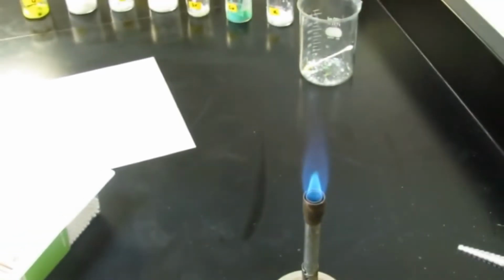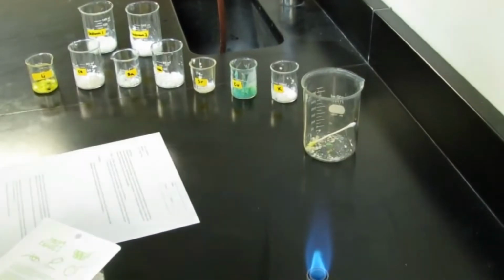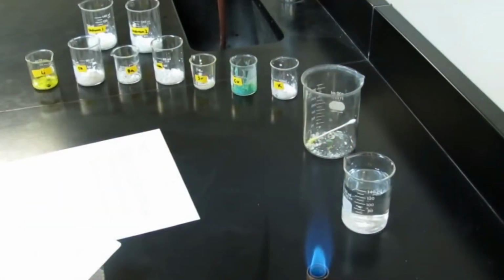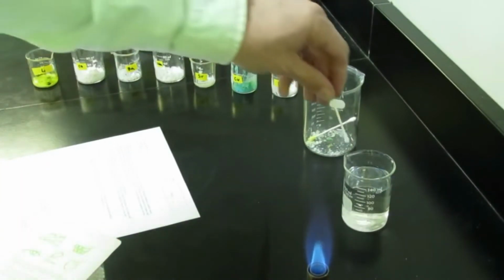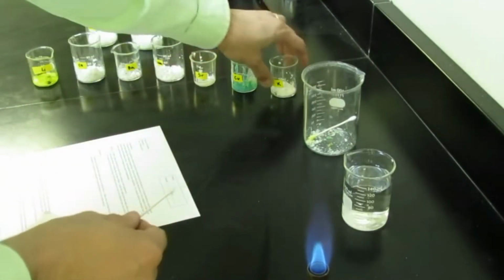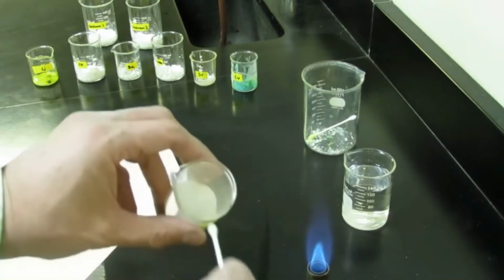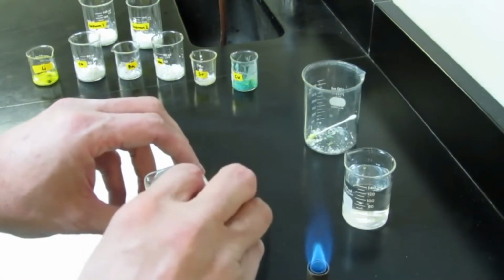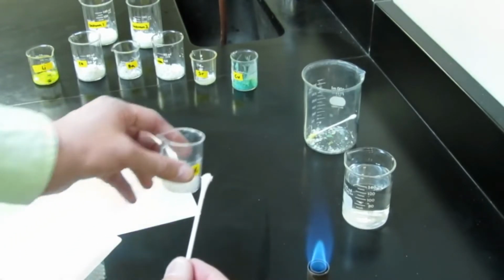What you're going to do is you're going to want to grab a cotton swab. Let's zoom back out a little bit. And for that cotton swab, we want to use a clean cotton swab each time. And the only thing that will enter into your distilled water beaker will be the tip of a clean cotton swab. We'll put that in the distilled water, get it nice and wet, and then we will take our first unknown. In this case, it's going to be our potassium salt, and we will go ahead and touch this to the salt so we get some salt on the moistened tip of our cotton swab.